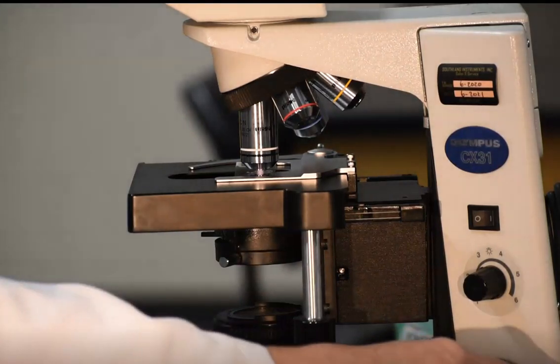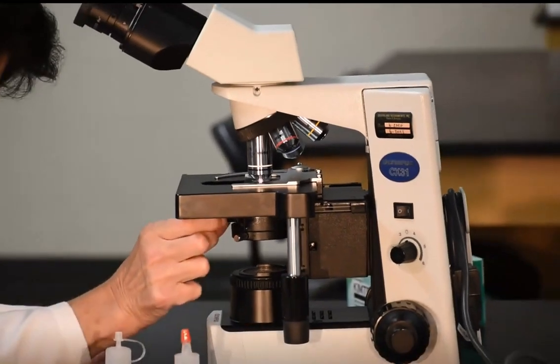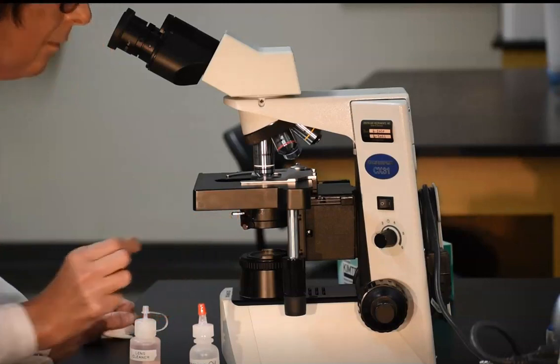To make the image clear, use only the fine focus knob. You'll need to adjust the light intensity up as well as move the iris diaphragm to achieve the best image.